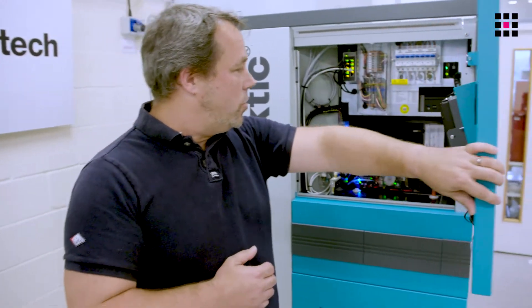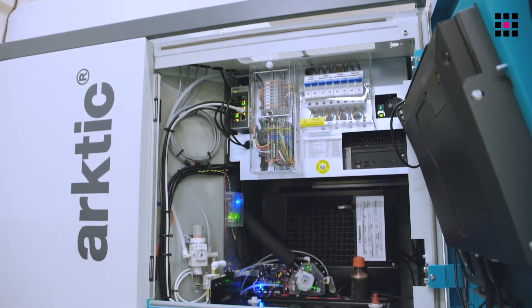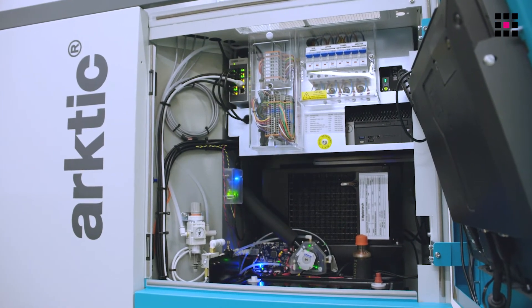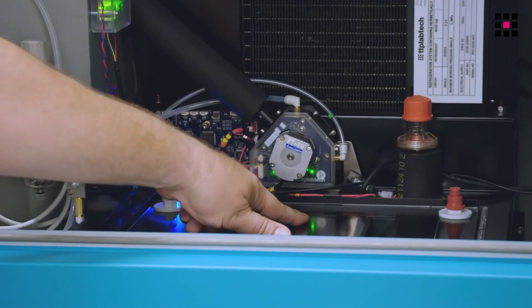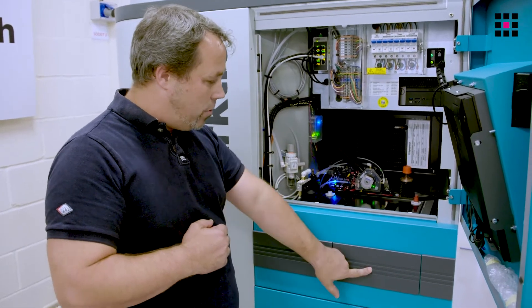If I open up the cabinet door, this gives you access to the rear system. The rear system houses the rack. The rack goes into the rear system through the hatch.